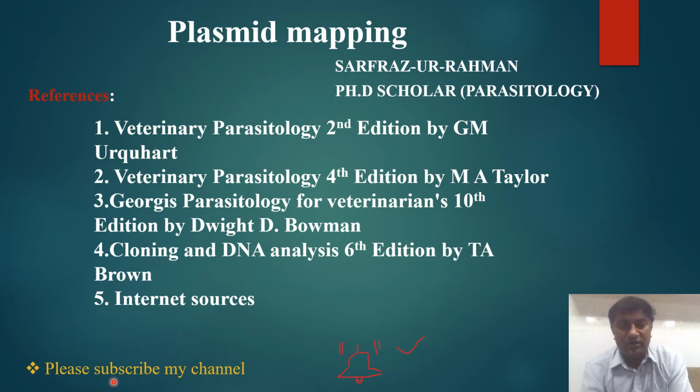Bismillahirrahmanirrahim. Today I would like to share the knowledge about plasmid mapping.